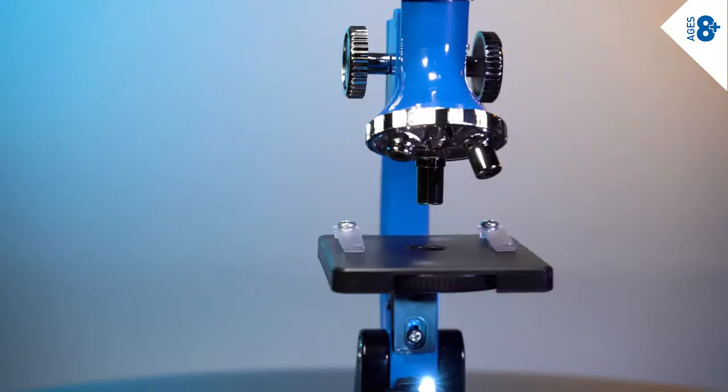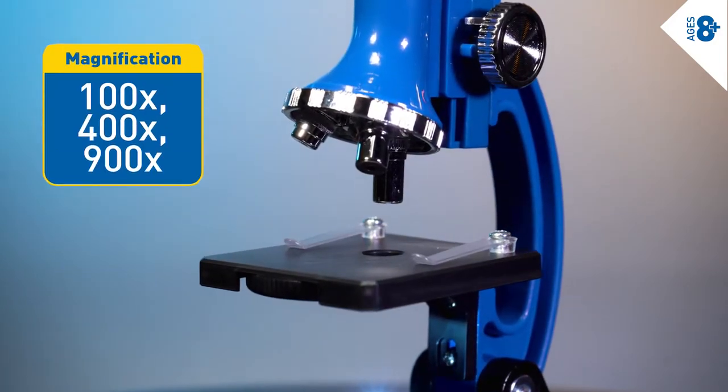Three objective lenses mounted on a rotating turret provide magnifications of 100 times, 400, and 900 times.